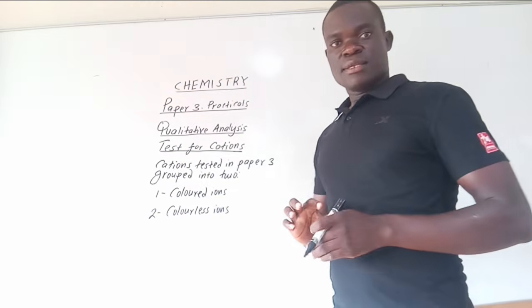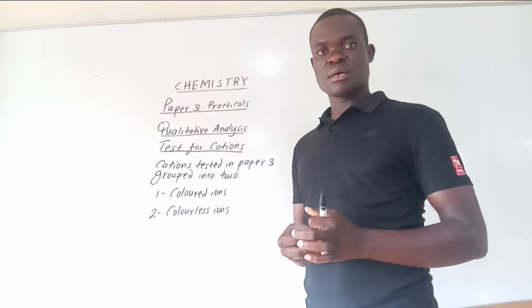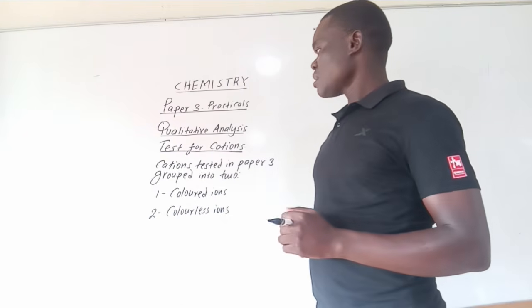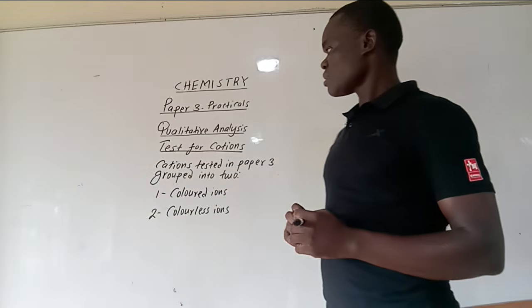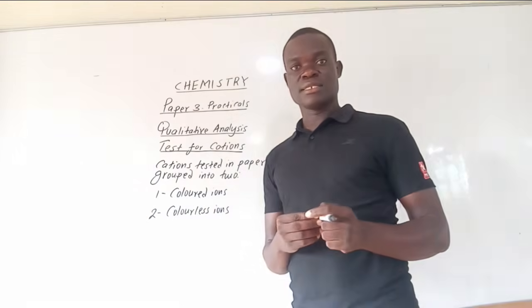So today we want to focus on test for cations. In paper 3, we have two groups of cations.